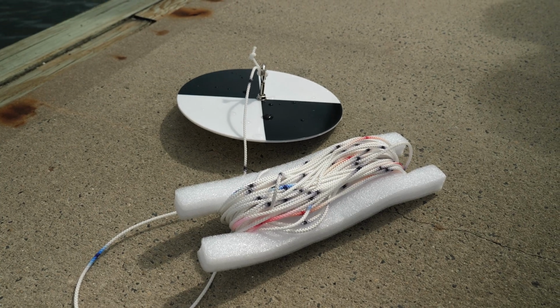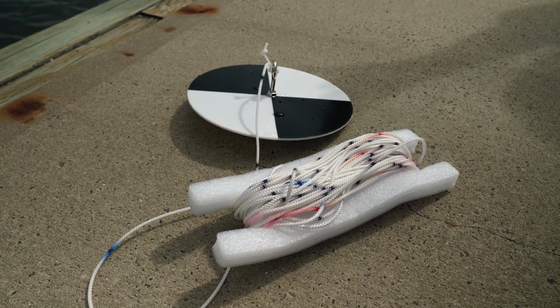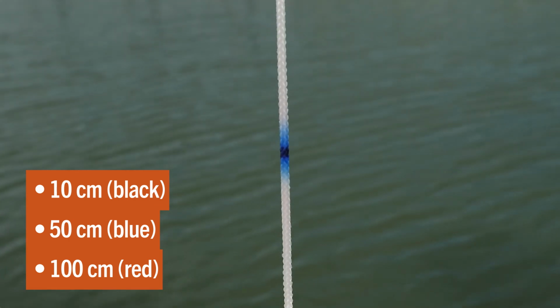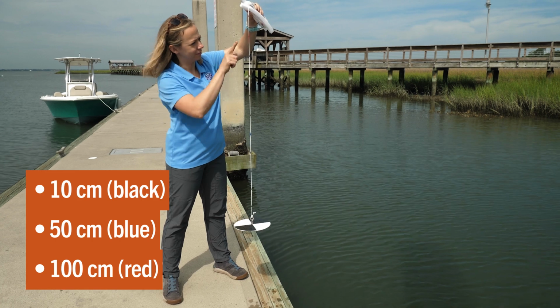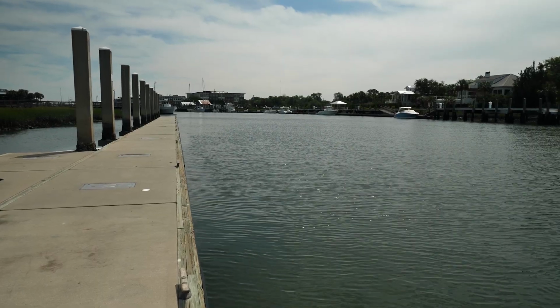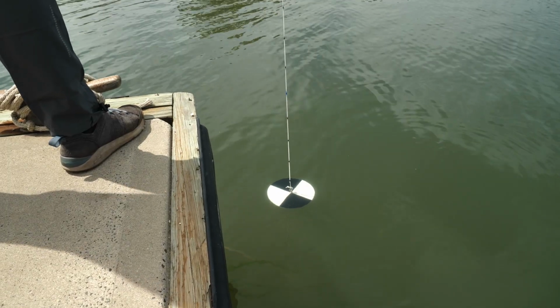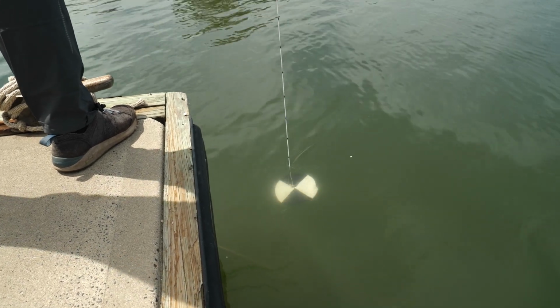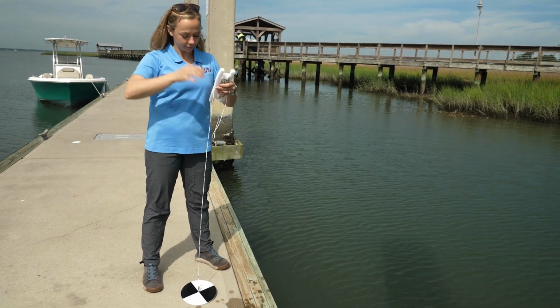A Secchi disc is a flat, circular disc divided into alternating black and white quadrants suspended from a rope. The rope has 10 centimeter, 50 centimeter, and 100 centimeter markings to accurately record measurements. The Secchi disc can only be used when sampling from a dock, pier, or boat, as you must be directly above the disc when taking a measurement. This is why it's important that the current not be strong enough to move your disc while it's being lowered or raised. Before taking any measurements, be sure to remove any hats or sunglasses.